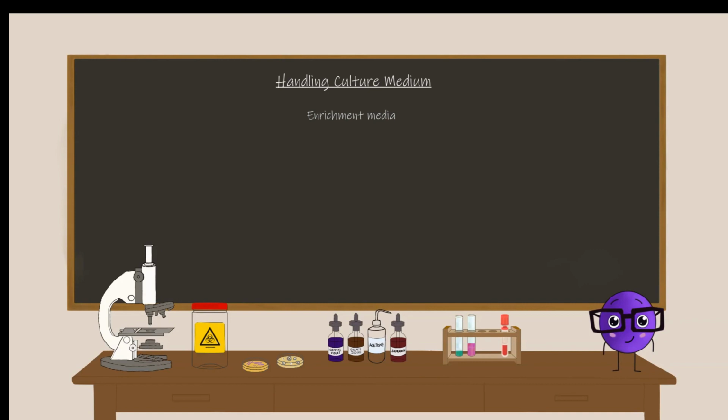Enrichment media. Sometimes the microbe of interest is present but in low numbers. Enrichment media acts like a special energy drink for the shy guests. It provides them with additional nutrients they need to flourish, making them easier to detect and study. Selenite broth is an example of this.